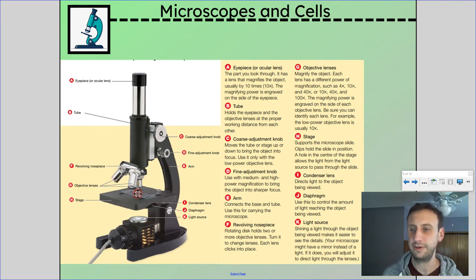When you're looking at something through the microscope, there's kind of this weird mix: you want to be able to see things, but you don't want it super bright. You want it dim enough that you can see structures and you have good contrast. So normally what you do is go bright and then start dimming it until you see the image itself start to get darker. There's kind of this sweet spot where you can see the most contrast, the most stuff, but it's not super in your face, washed out with light.